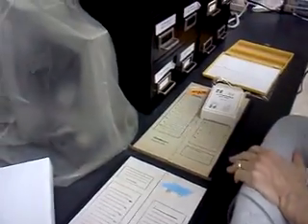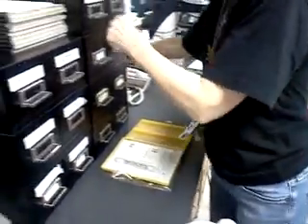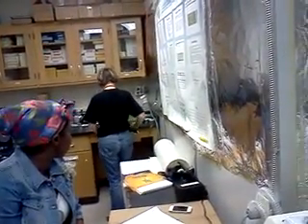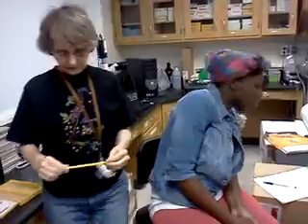There's another use for these sleeves. They're really handy. Here's the empty one. They're really handy when you're in a cut section. So we're finally getting into cutting sections. All right, you have to have a special pencil. You'll have to order these to get them. But if you know what place I know to get them, order them. These are Ticonderoga 3H's.